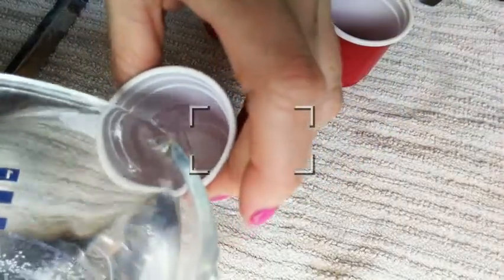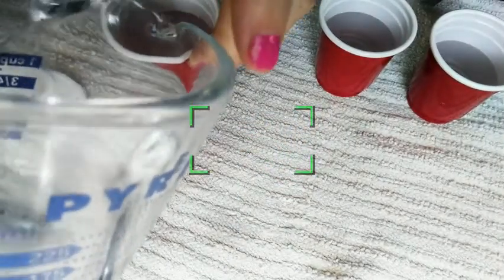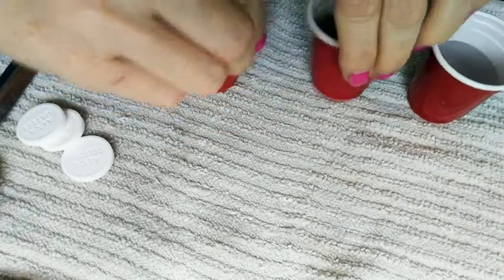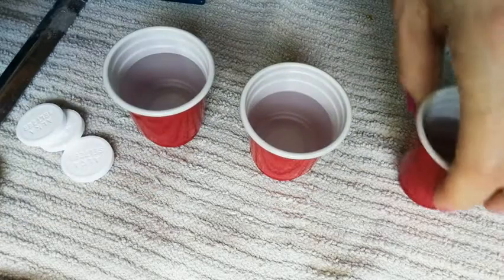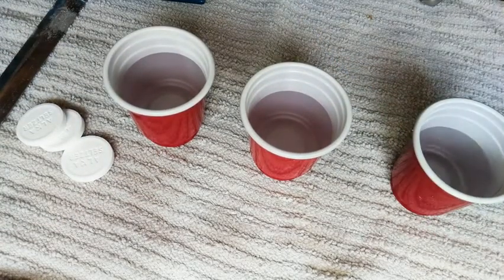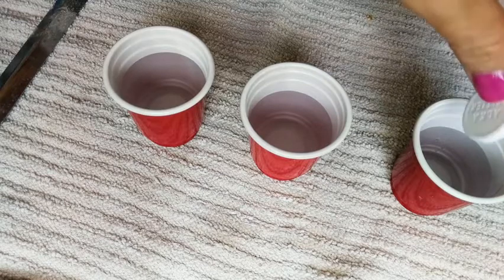Okay. So we're going to go ahead and fill these up here with the same volume the other guys had. This will be a little bit easier to make it simultaneous too. Let's again line these guys up. And I will get the timer going the second I get these guys all dropped in.